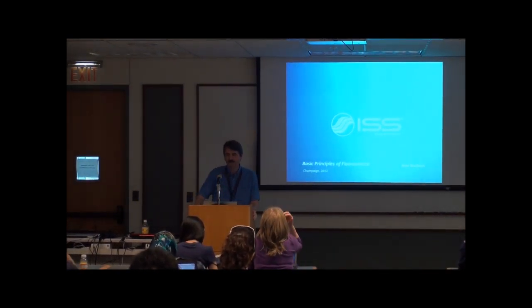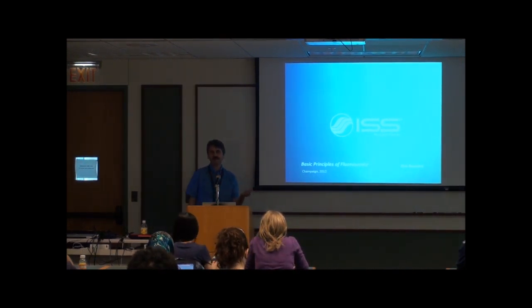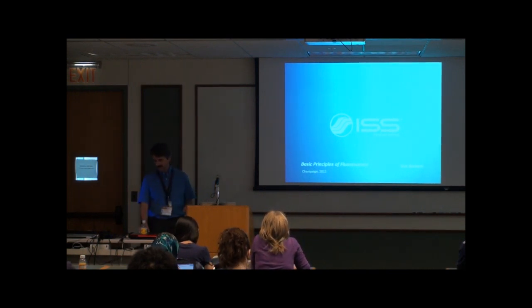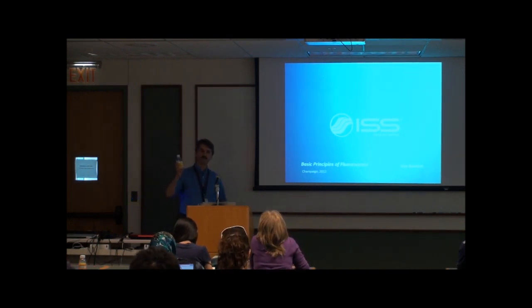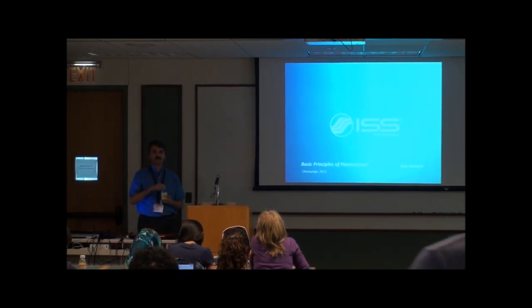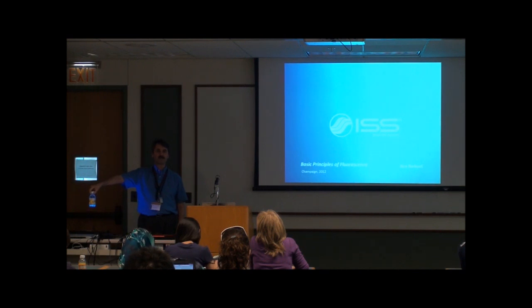We are talking about fluorescence. What is fluorescence? Fluorescence is the emission of light that a substance has upon absorption of light. Here I have some tonic water, and I brought it because Professor Clegg, I know he likes it, but I brought it also for another reason. I have a UV lamp.